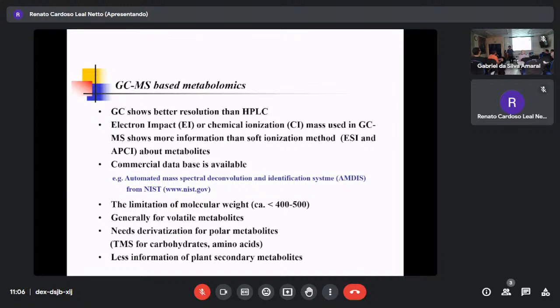Now, in HPLC there is interaction with both phases. But in a GC column, I'm only interacting with the polysiloxane, and helium is just driving, moving the sample. But then resolution should not be good, right? Instead, gas chromatography uses another factor, temperature. That's why GC inherently has sharper peaks.